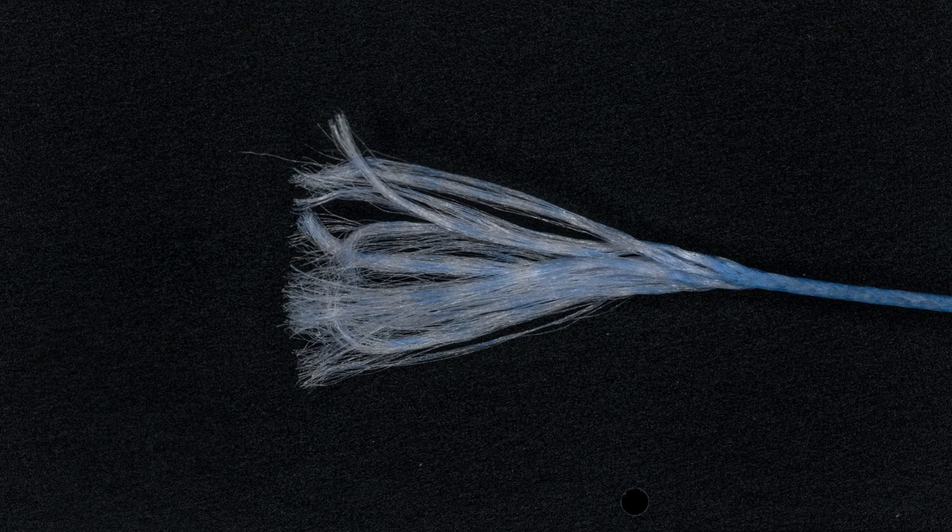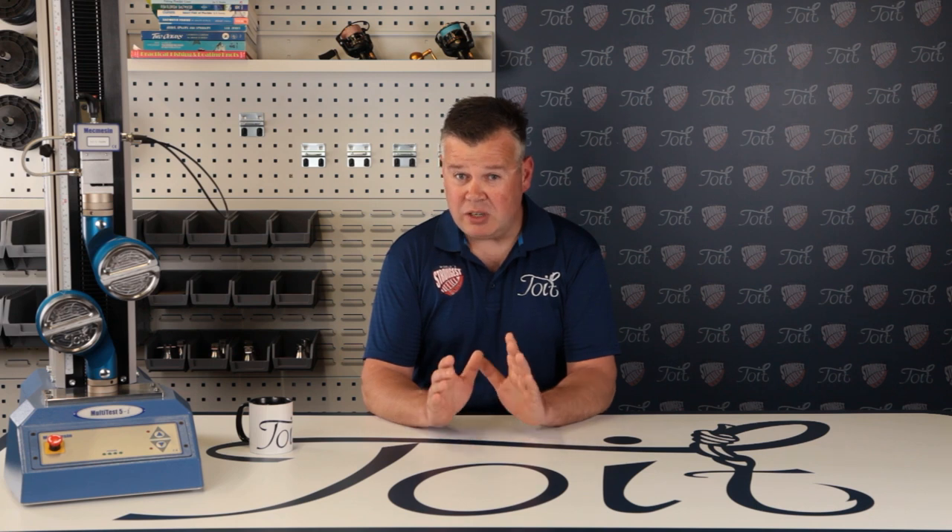Before we get started, let's look at an individual piece of braid. This is 20x magnification, 50x magnification, and 150x magnification. Here you can see the individual fibers in the carrier all bunched up, and the various carriers woven in a pattern to produce the braid line. At 400x magnification, you can see in this very high quality braid how uniform in size and distribution the individual fibers are within a single carrier. At 20x with the carriers teased out, you can also see the blue braid dye has not penetrated the inner fibers — fairly typical of most braids.